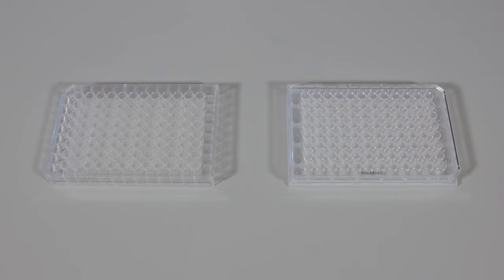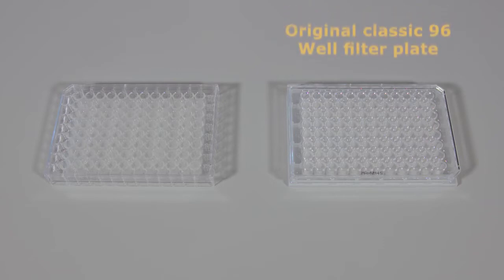Two types of multi-screen plate formats are available. The original classic 96-well designed filter plate incorporates the under drain and plate support functions, known as the plate skirt.